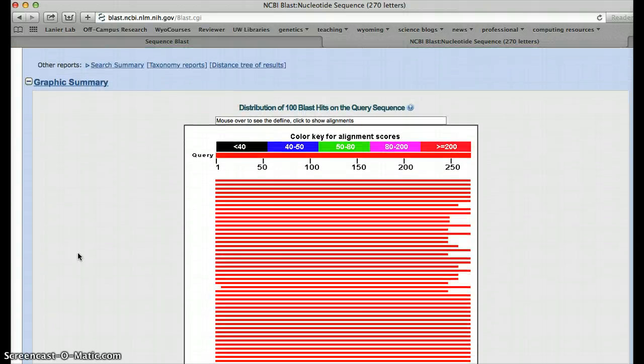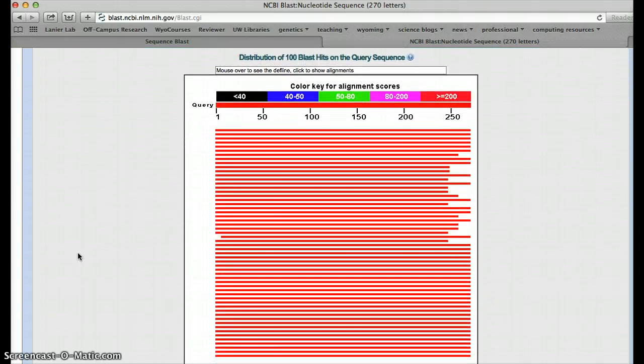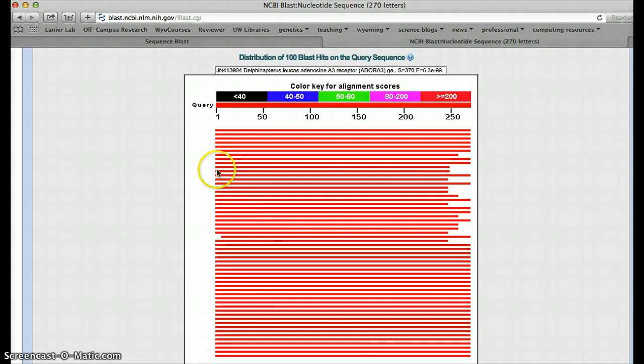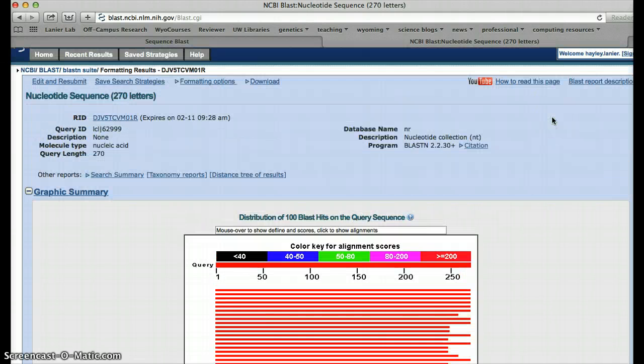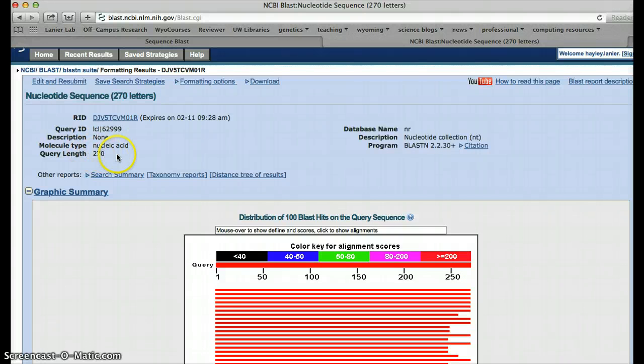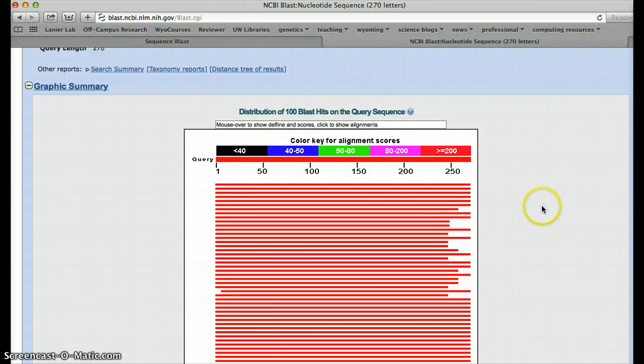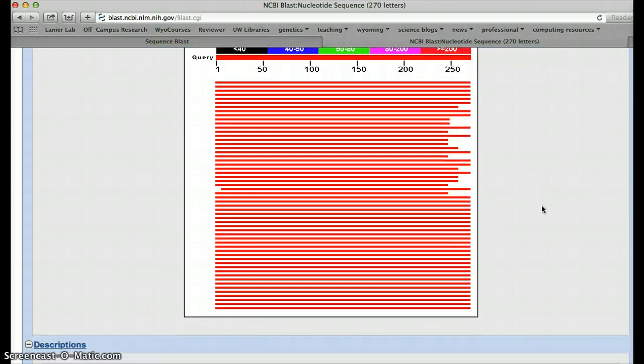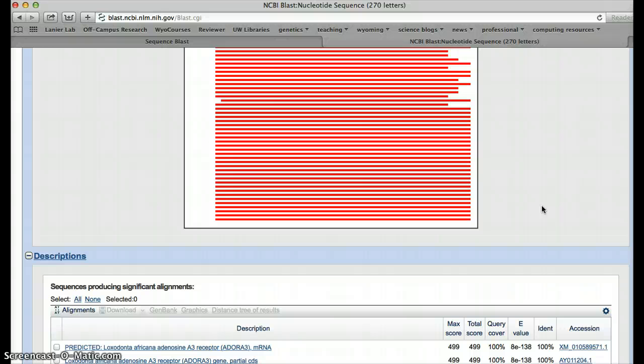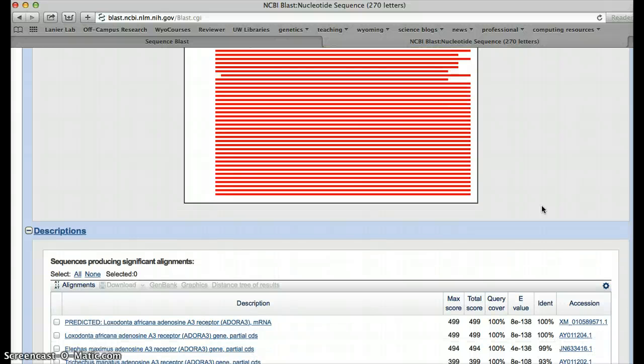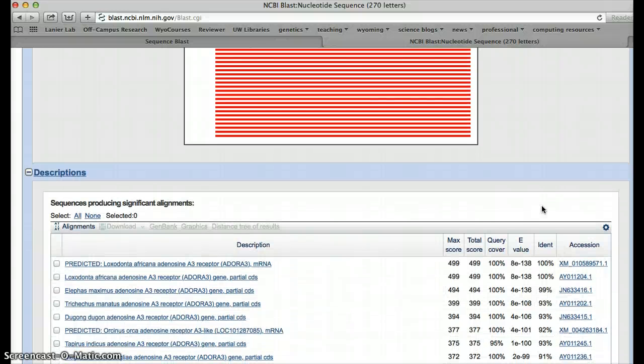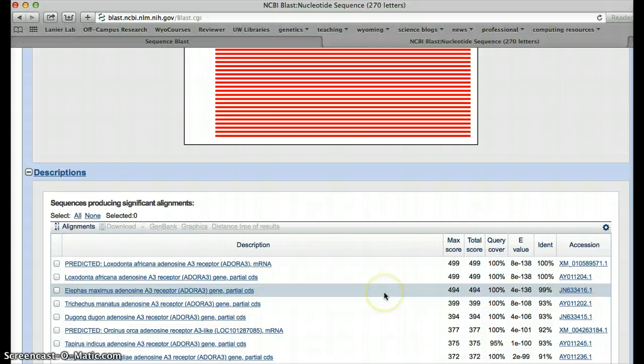So what we see here are the top 100 hits, and we see the degree to which those hits overline with our sequence. So the sequence that I submitted is just 270 base pairs, but some of the hits here cut off before 270. They may be very similar, but they're just not as long in terms of query coverage. So we're going to go down here, and we're going to look to see what this looks like.